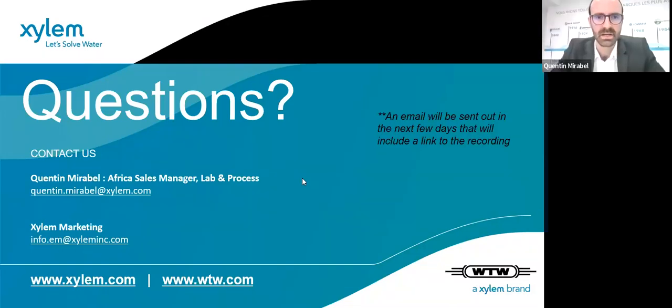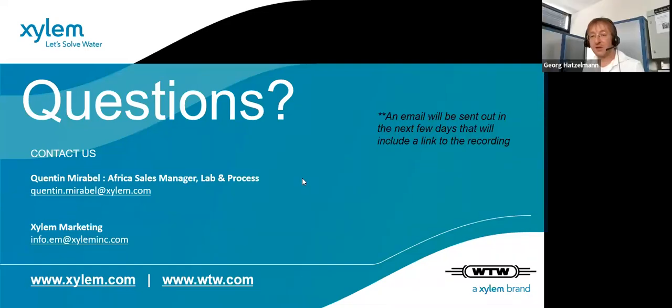Okay, thanks. Another question: are the sensor and transmitter explosion proof? ATEX? Okay, simple answer, no. We have no explosion protection certification. It needs too much energy, so you cannot put it in an explosive area.